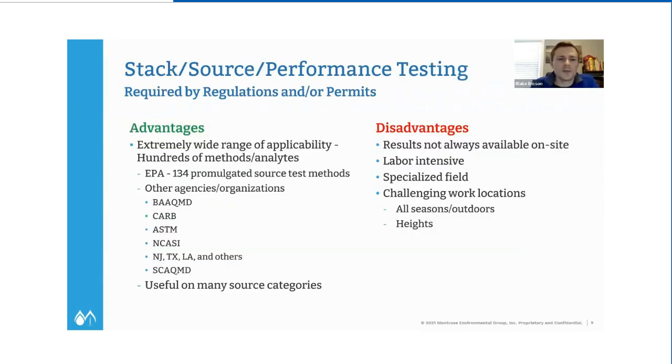So real brief, we're not going to hit this too hard, but stack testing is essentially required by regulations. And that's how we stay in business, based off of what is out there from a regulatory standpoint. The beauty of stack testing, and this kind of ties in with the FTIR a little bit, is because there's a wide range of applicability. Don't just check that compliance box. Understand that if you're doing stack testing, you can do it for engineering purposes.